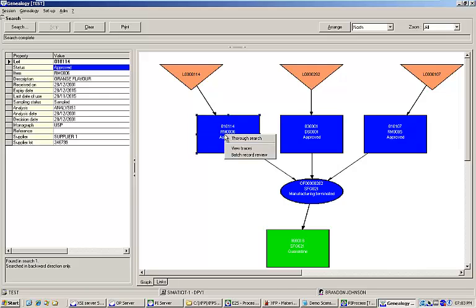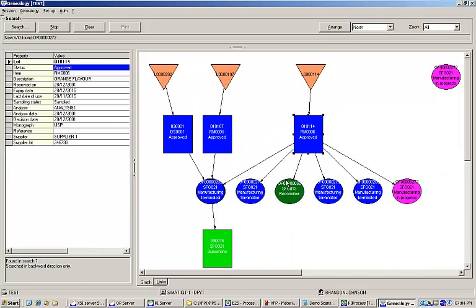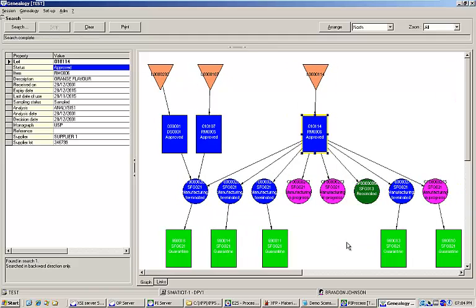Performing a search on a specific container will show you every other work order that container was used in. This powerful function allows you to easily manage and limit the impact of quality events like material contamination and product recalls.